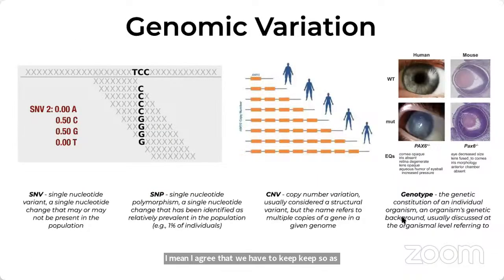So how do we identify these genomic variations, right? These genomic variations can be identified by subjecting the samples to high throughput sequencing or next generation sequencing, which you will learn a lot about in the upcoming sessions. When we map all these reads to specific positions in the reference genome, we can identify the positions in which that specific nucleotide is changed, or converted into a variant or mutant form.